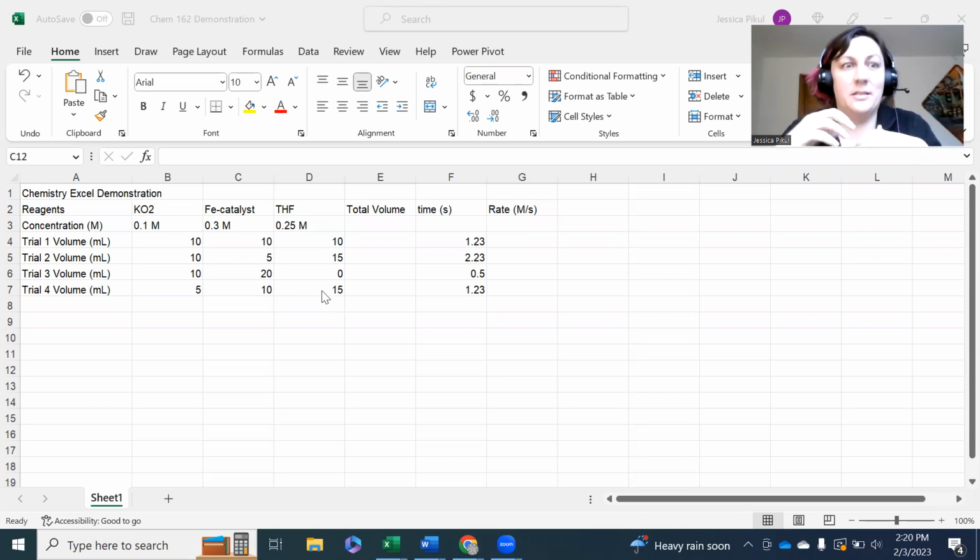Hi, I would like to talk about using Excel or Google Sheets to make your life easier. I know that working within programs like this has a pretty steep learning curve, but as you get used to them and learn them more and more, they can save you a lot of time in the long run. So today I'm going to focus on just how to save yourself time with the kinetics lab that we're doing in our Chemistry 162 class.